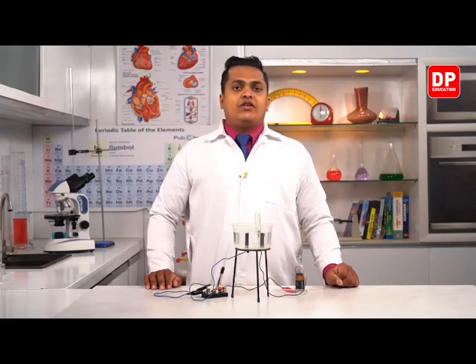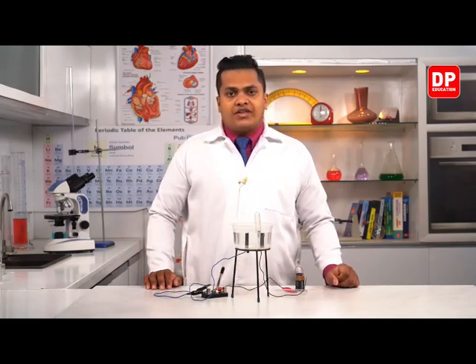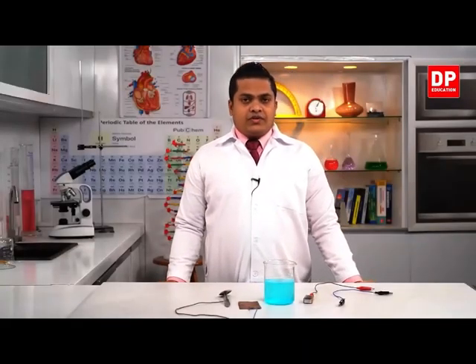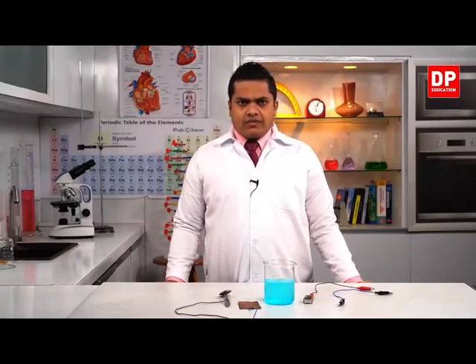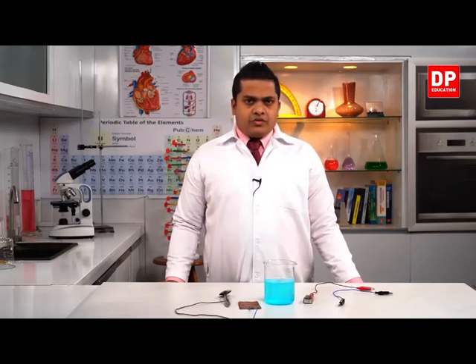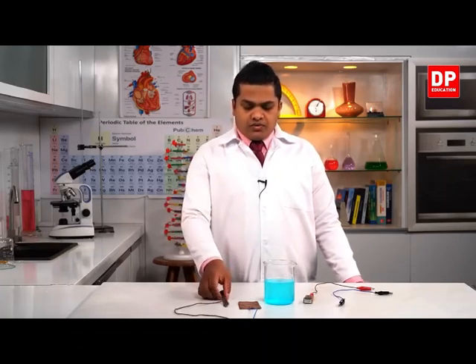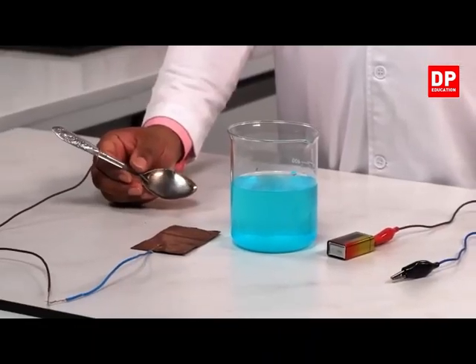Right then, let's head on to the classroom once again, and we'll write down our observations and conclusions from the activity. So my dear children, here also we are investigating the chemical effect of the electric current. But this time, I'm going to use the electrolysis process in order to plate copper on the spoon that I have here, right?